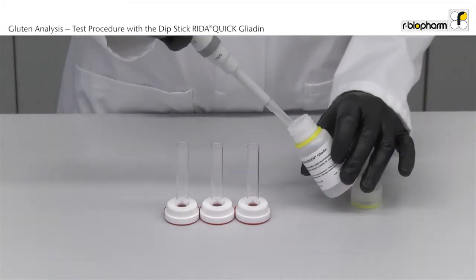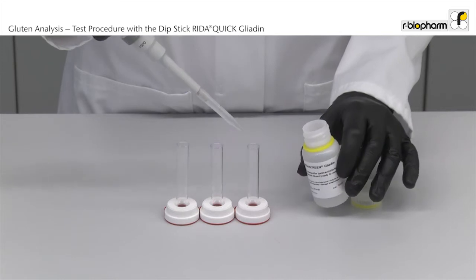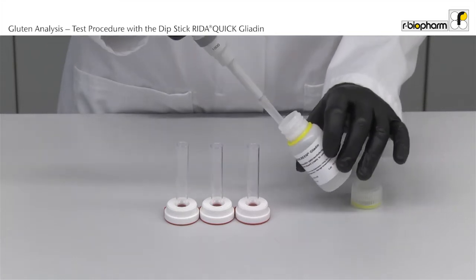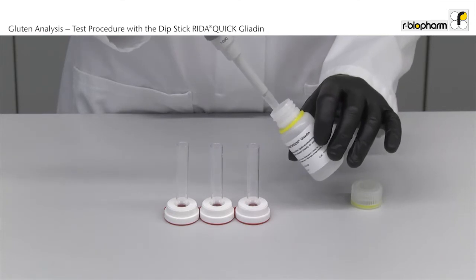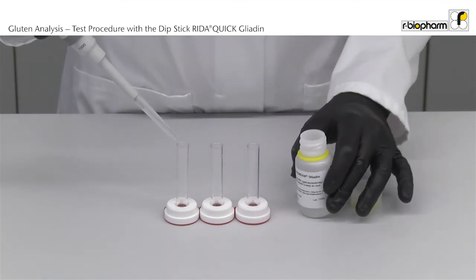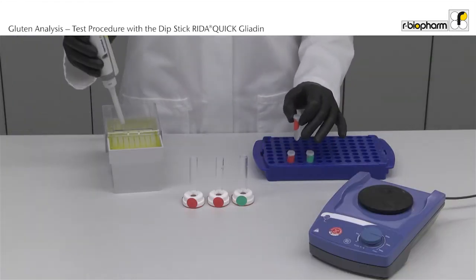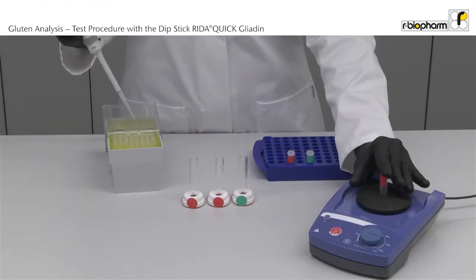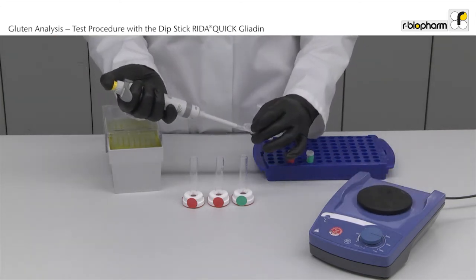Pipette 0.5 milliliter of the buffer to the vials. Vortex the supernatant. Then pipette 50 µL of the supernatant of the extracted sample to the vials.